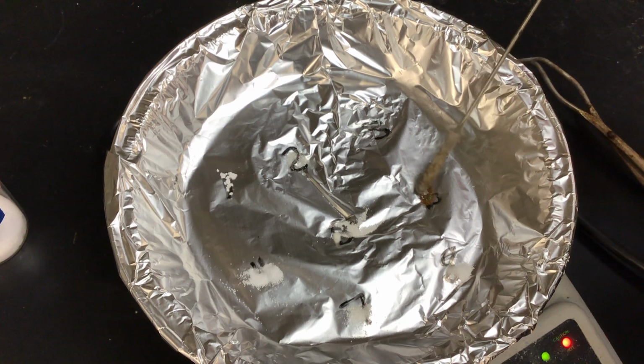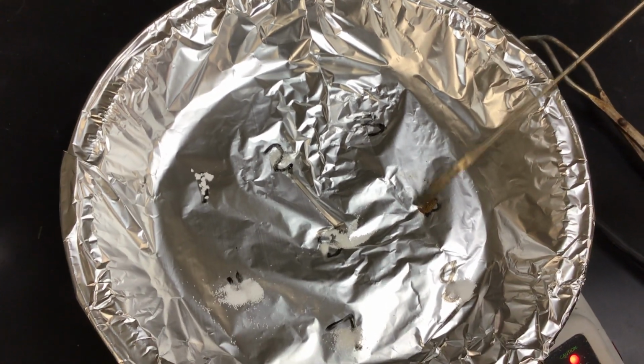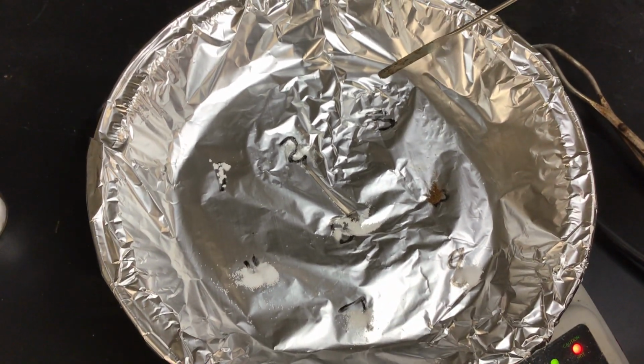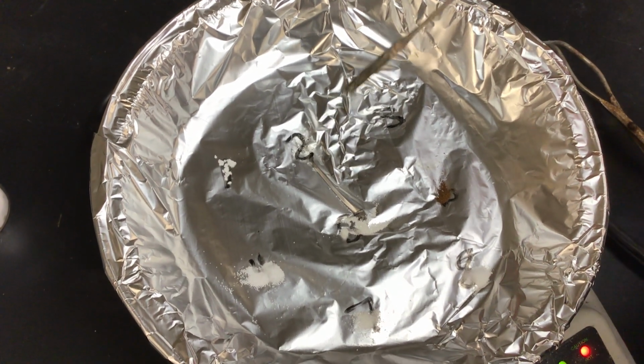Now, number 6 did not actually melt. It just turned black or brown in color. It's actually still there. It has not melted yet. So the only one so far that's melted is number 3. Now, number 2 is beginning to melt.